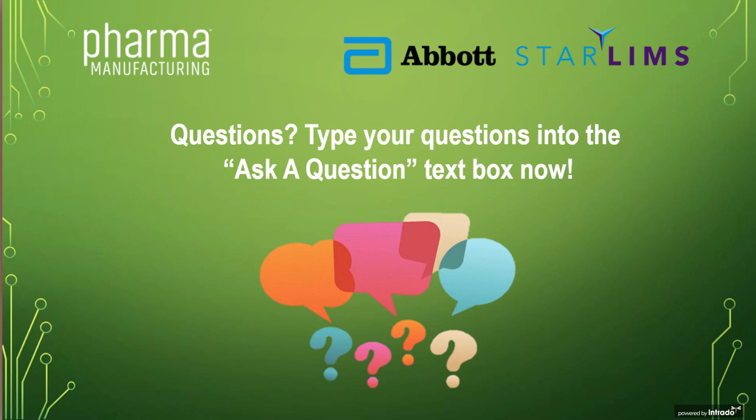Okay, great. Another question from an audience member for either of you. Is it required to maintain chromatographic raw data, area, system suitability, et cetera, in LIMS, or can they get a final value calculated from CDS? You always need to keep the data in the system of source, but my recommendation is always let the system of source do the calculation, what it does best, and you can always send just the result, or calculated result, to a LIMS system.